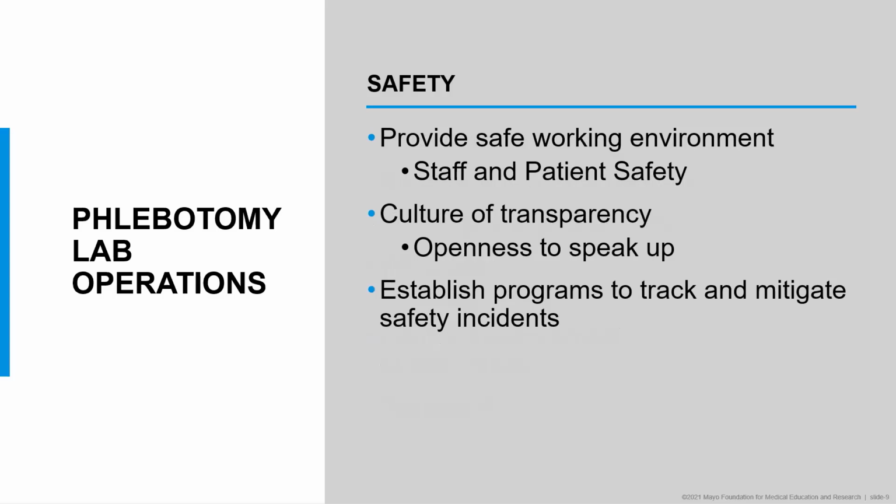If we have injuries in the work area, that's going to reduce the number of staff that you need to do the work. So safety is very key in any work area. So we want to provide a safe working environment to both our staff and the patients. We don't want to have any safety issues with our staff that do the work, as well as our guests, the patients that come to the work area. So having a good working environment, making sure that you periodically look at cleaning up your work area, even having a safety audit, helps in making sure that you're maintaining a good, safe working environment.